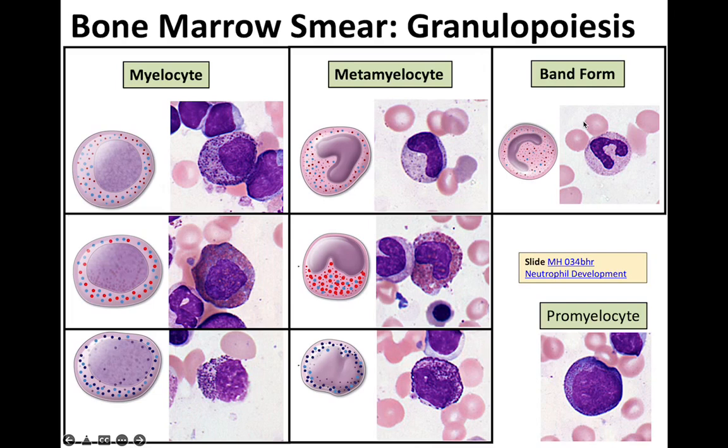So the neutrophilic lineage has one additional stage, which is the band form. In the band form, the nucleus is C-shaped, and it has equal width throughout. It looks like a sausage. But in eosinophilic and basophilic lineages, the metamyelocyte will change into a mature eosinophil and basophil.